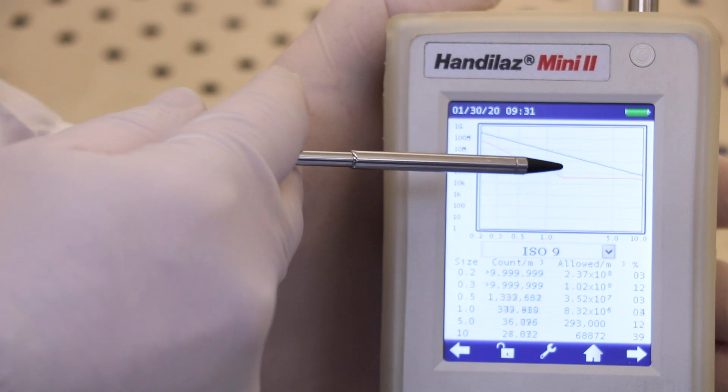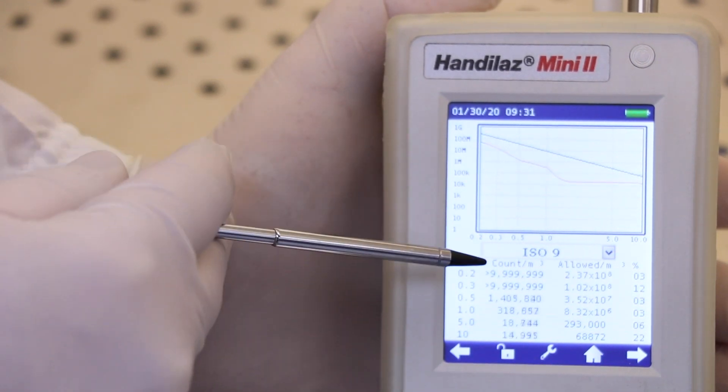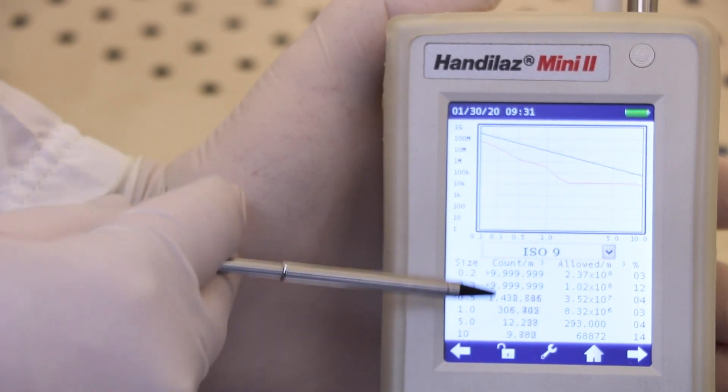Now watch the red line, which represents the actual particles being measured from a volumetric standpoint. These are registered in the left column in the table.